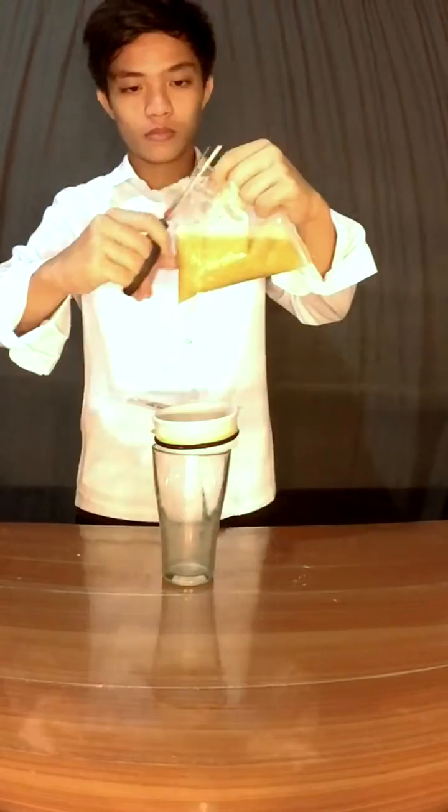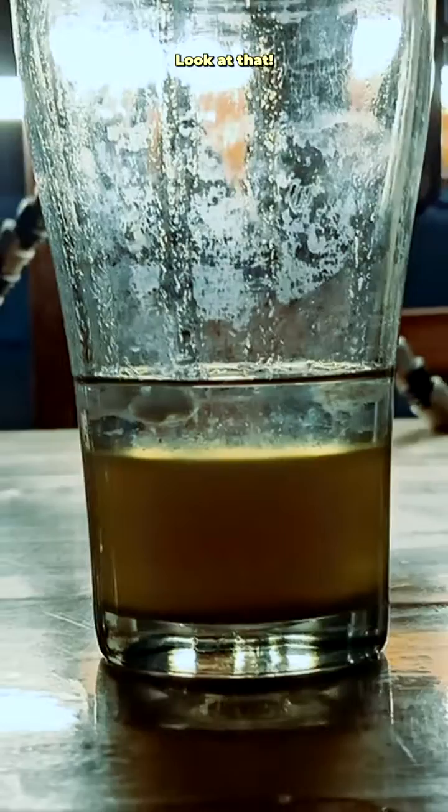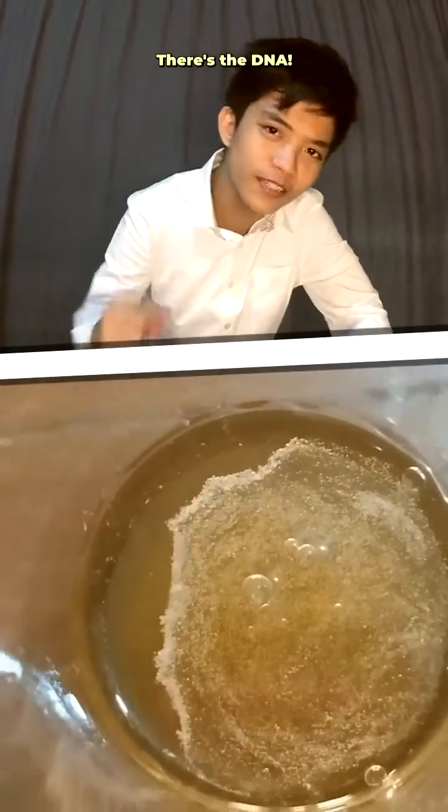Afterwards, I filter it. And finally, I add the alcohol. Look at that! Ta-da! There's the DNA.